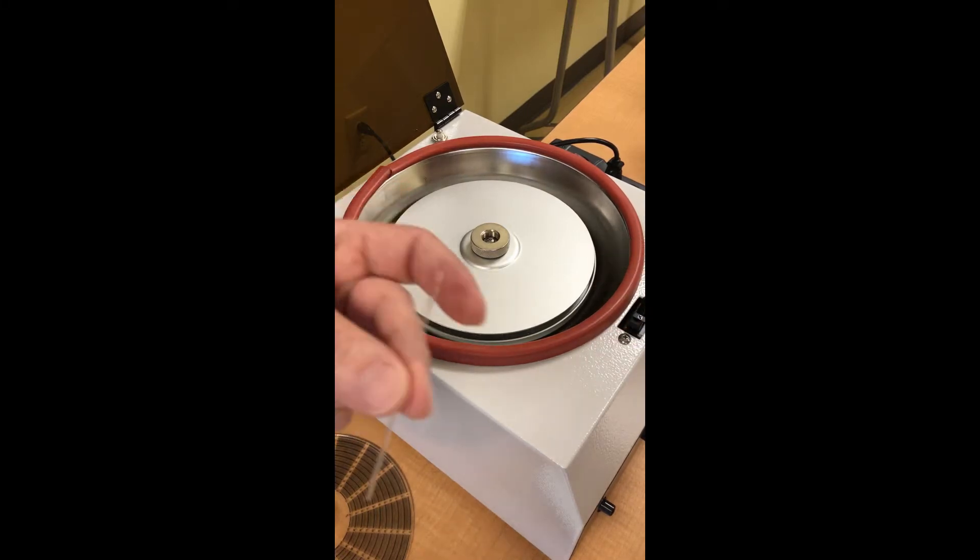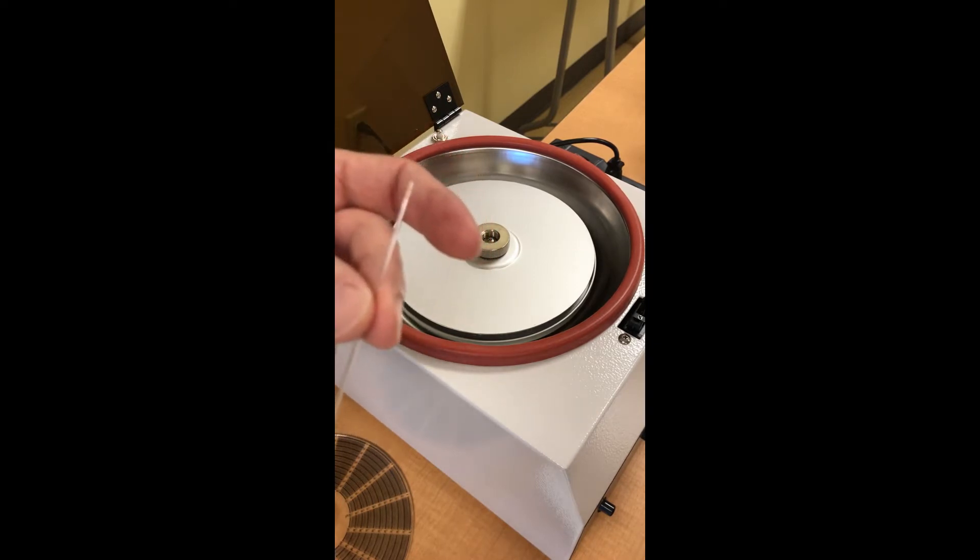All right, let's take a look at centrifuging blood to determine hematocrit. Remember that hematocrit is the percent that red blood cells make of total blood volume, and for most people that's somewhere around 45 percent.